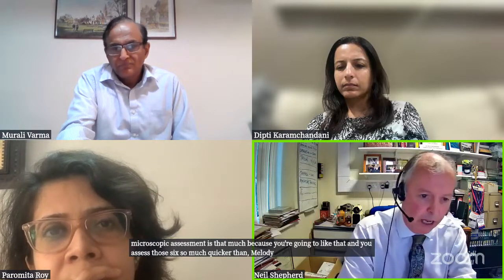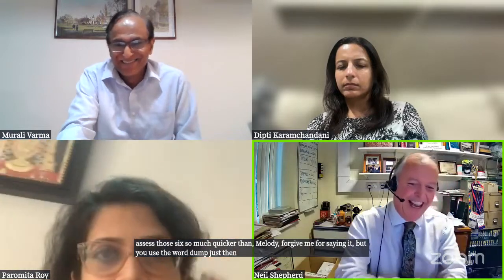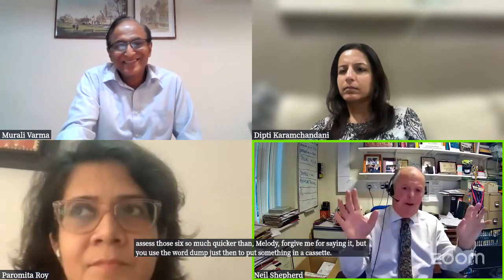Murali, forgive me for saying it, but you used the word dump just then to put something in a cassette. I don't dump. I very carefully put. I'm sure you do. That's a really important aspect of it.